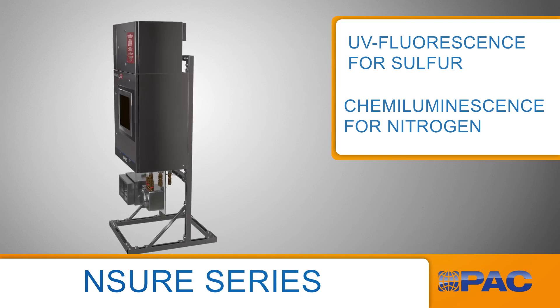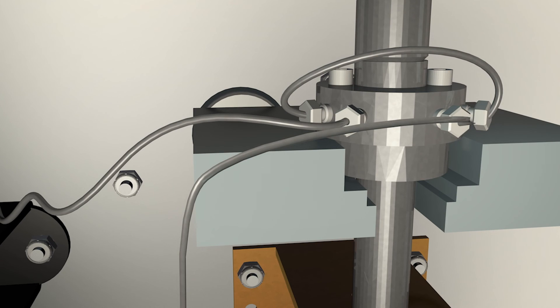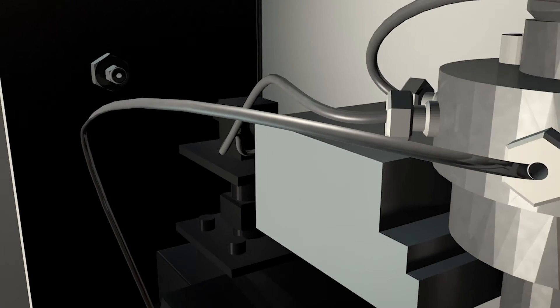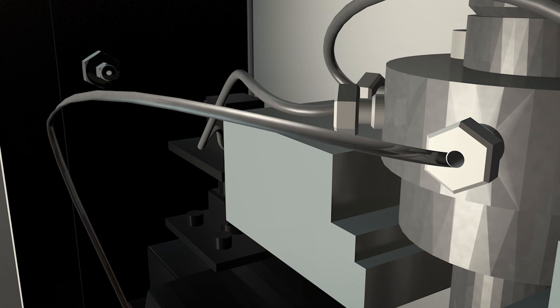The first step is the introduction of the sample. Ensure utilizes a direct injection system, which means the sample is completely combusted during every measurement cycle. The injection valve directly delivers a microliter of sample to the furnace for analysis.